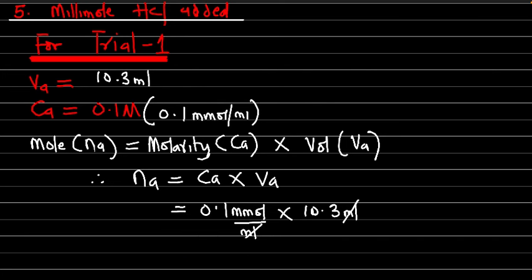This becomes 10.3 times 0.1, so we have 1.03 millimole.